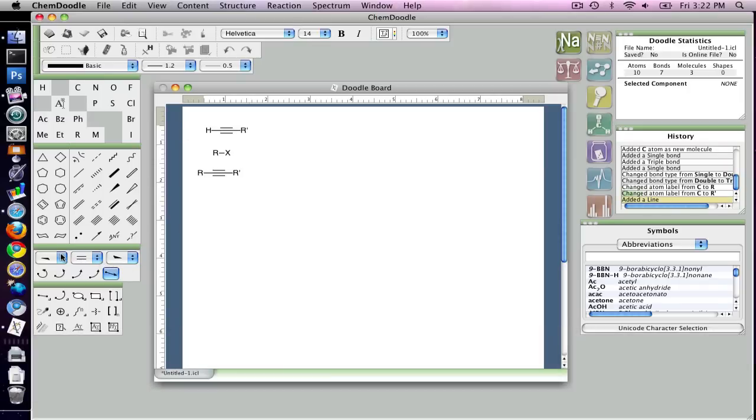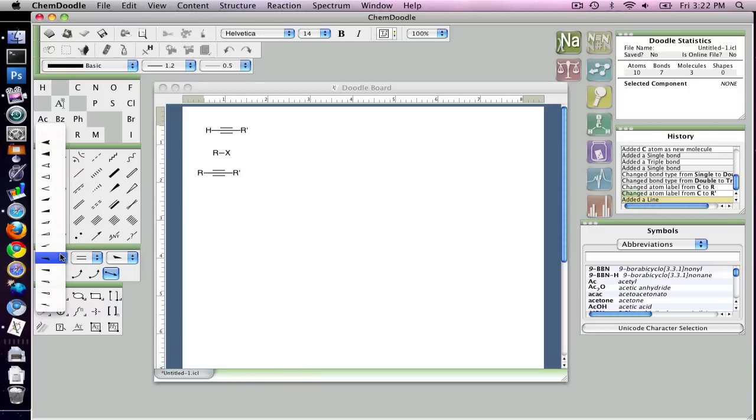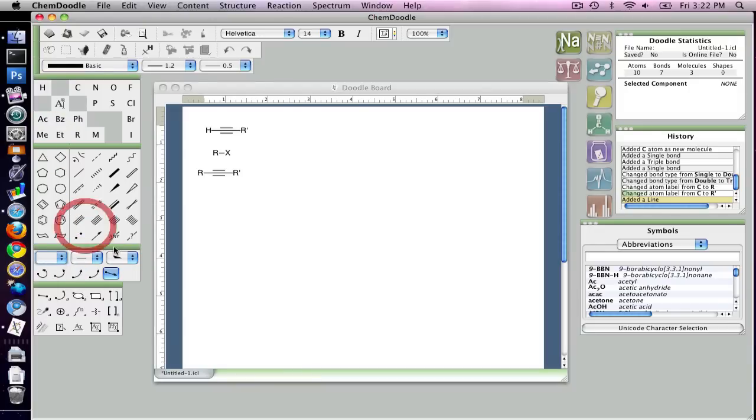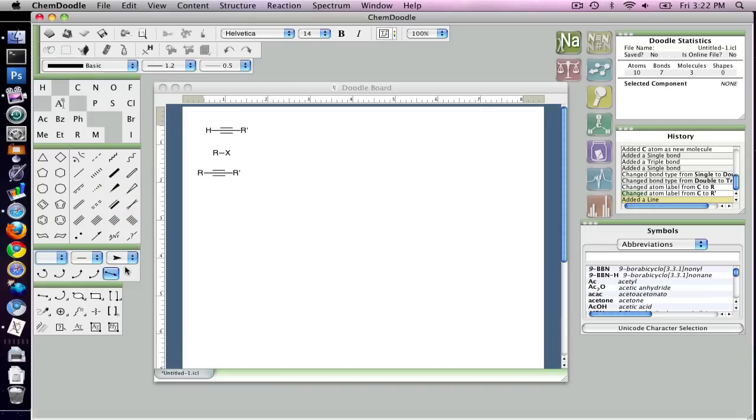So I'm going to try to reproduce the Wikipedia image as closely as possible, and so I'm going to go back just to a single arrow. And again, place it.